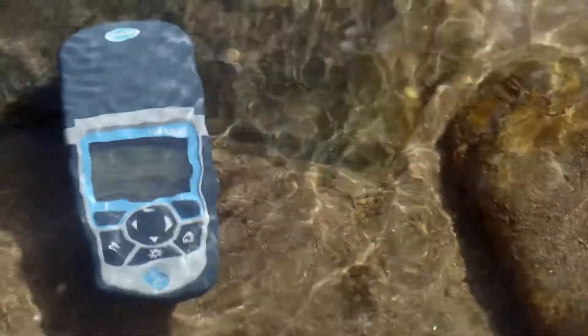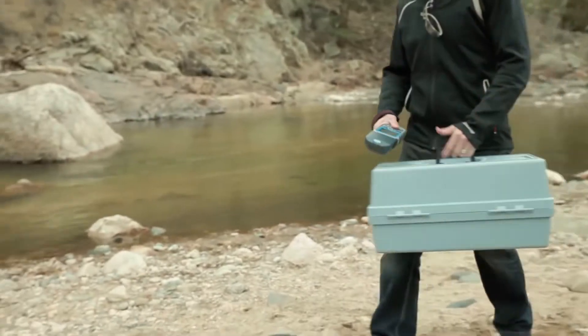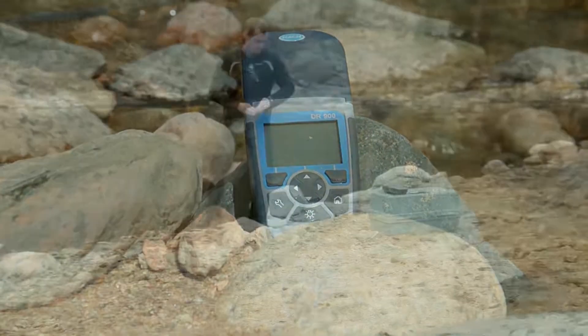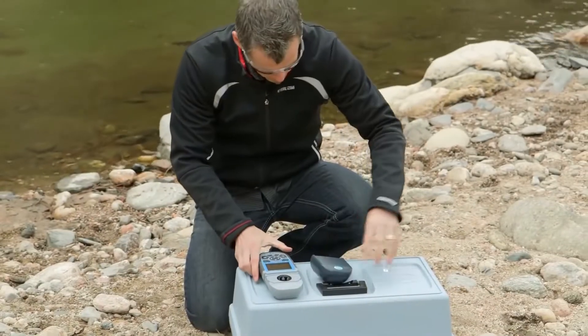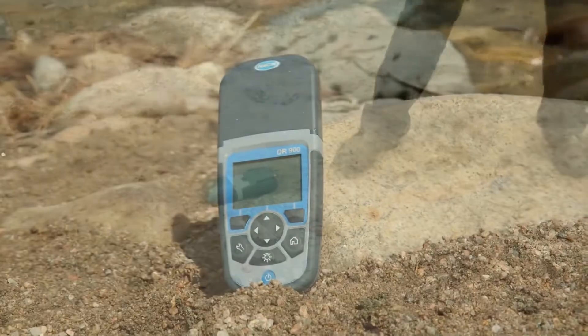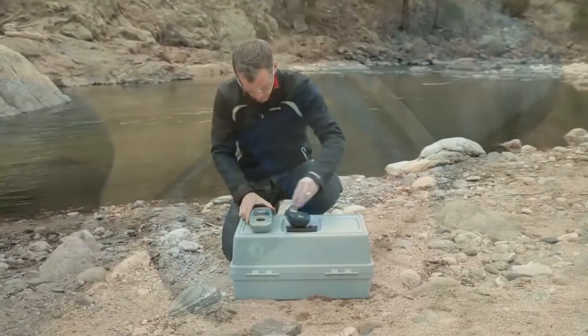So we built the DR900 to resist water, dust, and the accidental drop. The end result is something you can trust for your demanding field testing needs. It is impossible to avoid the potential grit of everyday testing. You need something that you can pick up, wipe off, and then test with total confidence.